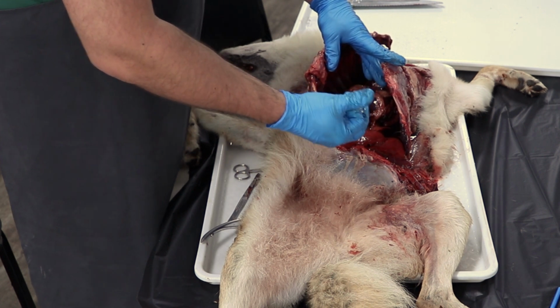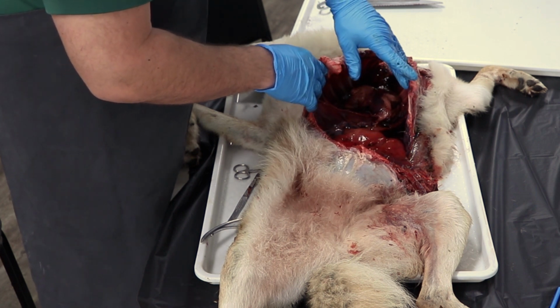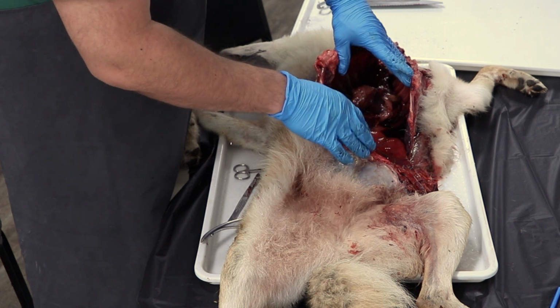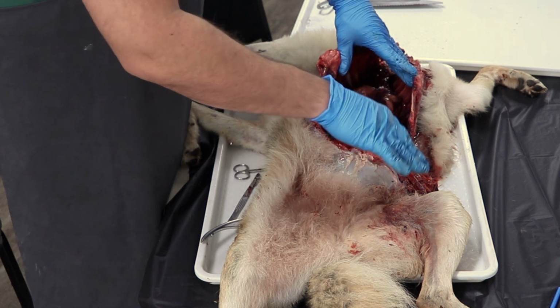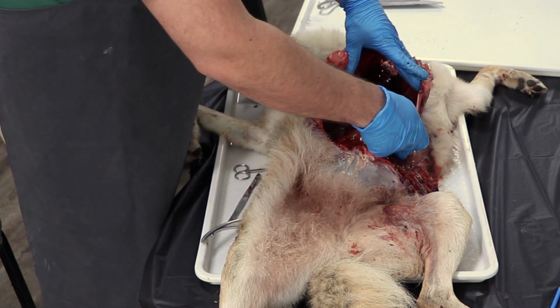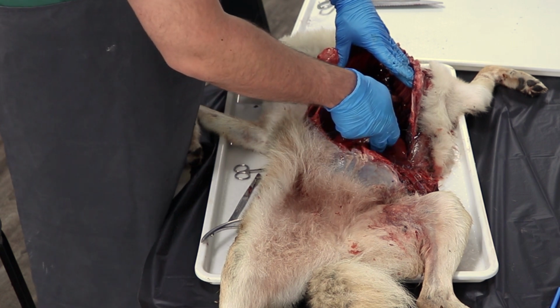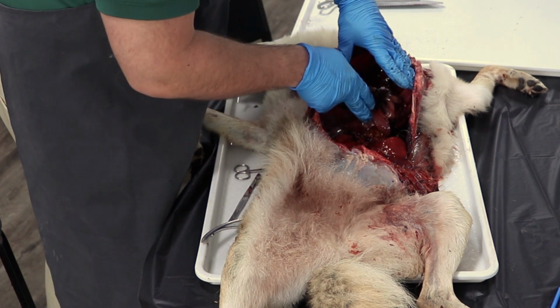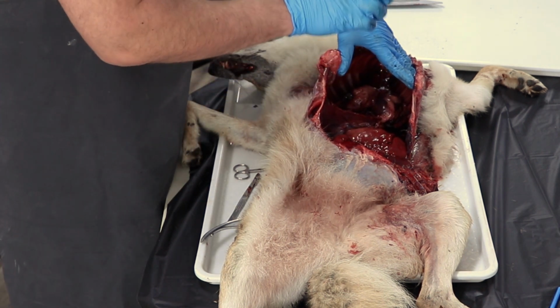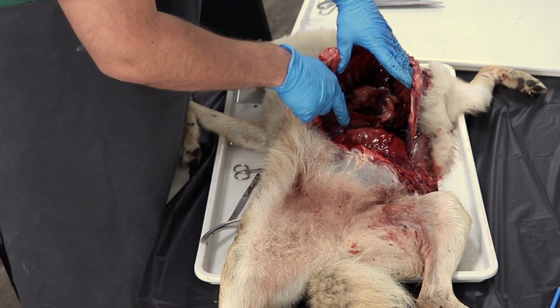It helps create bile for the metabolism of fats, and it also converts the metabolic waste of the cells into urea, which is passed through the urinary system. Now, what we couldn't see in the snake, but we can see in the coyote here, is that the liver is divided into several large sections. And one thing I'm gonna do is use the predictive power of science to guess that a coyote probably has a gallbladder in here.